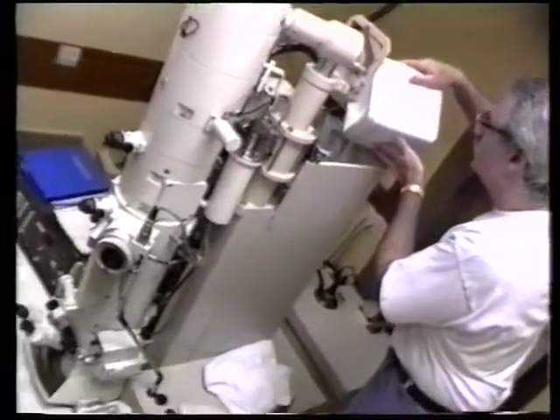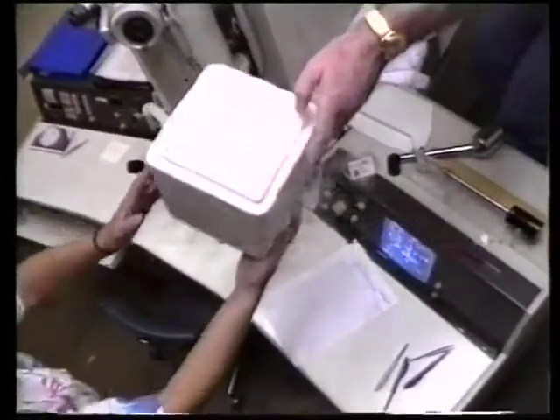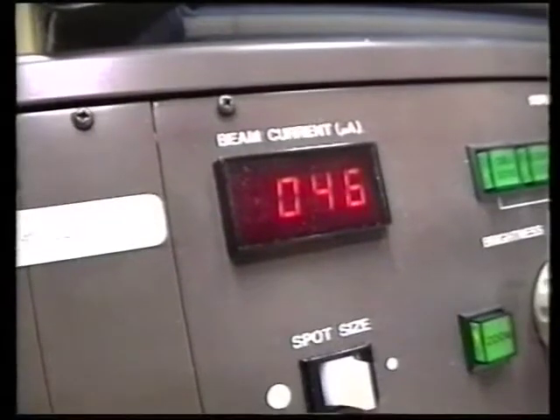So it's really a valuable tool for us in the beginning, because the only way we can actually tell if there are viruses in those extracts of the shellfish is if we use the electron microscope. So it's essentially at this point the only tool we have to confirm our ideas.